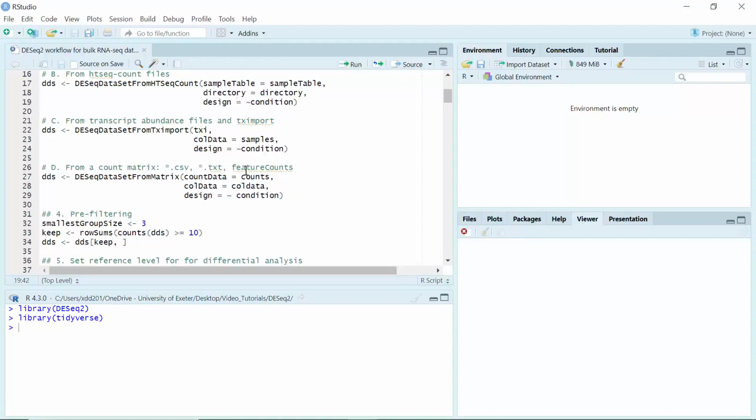If you use the R Subread package to quantify your original sequencing data, you can get the count matrix from the featureCounts function. I have Subread video tutorials that showed you how to quantify the sequencing data from original sequencing files and use the featureCounts function to create a count matrix. So we will use this function to perform our analysis.